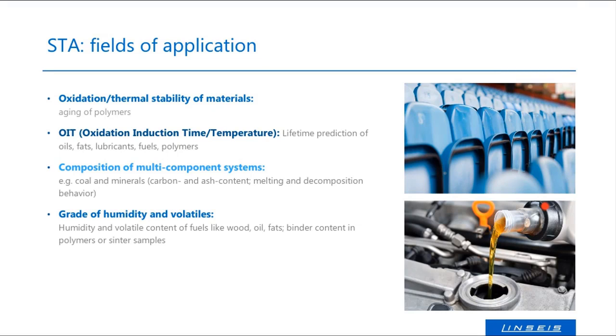Regarding the applications, I want to describe what's typically done with an STA, so really with the combined system. One of the most used fields, of course, is the decomposition analysis and thermal stability of materials. What's always of interest in any kind of DSC, and especially with the STA, is the oxidation and thermal stability of polymers, or oxidation behavior of anything that can burn, like lubricants, fats, oils, polymers.